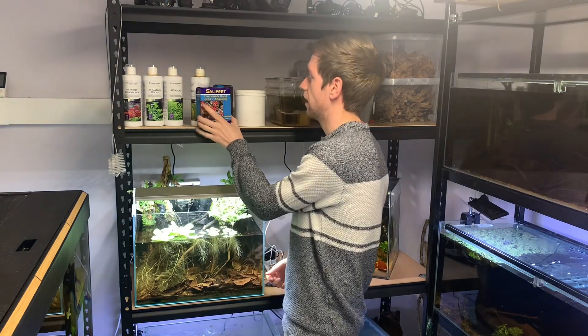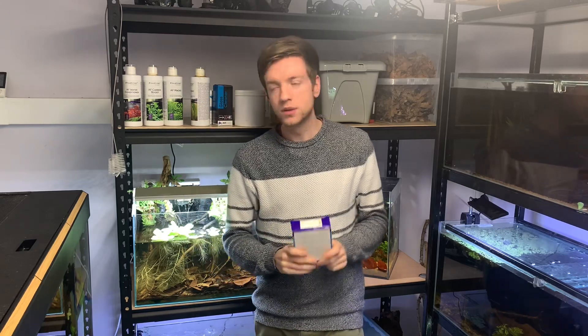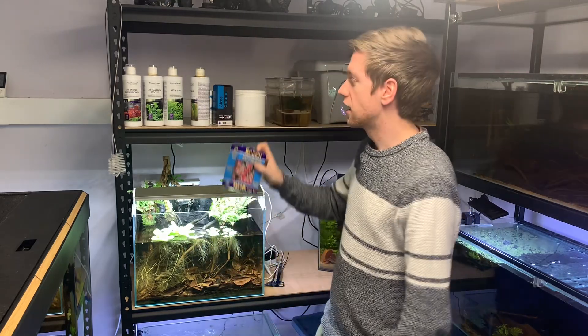So first of all I'm going to test the water, and that is going to be done by this Salifert carbonate hardness or alkalinity test. This is my go-to hardness test and I'm going to talk you through how the test works and what the results mean. I'll then explain a bit more about what carbonate hardness is and why it's important. So let's get started and test this water.